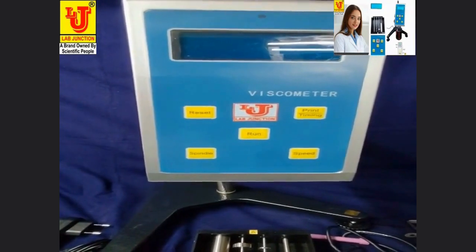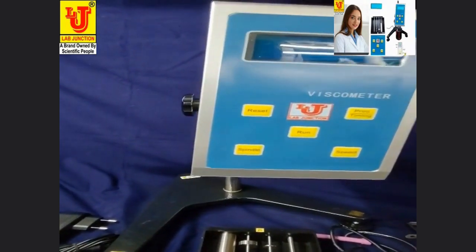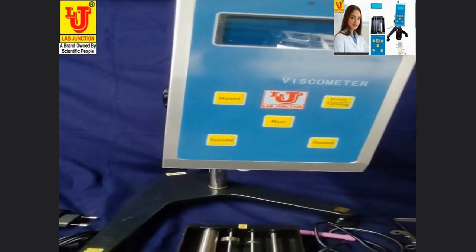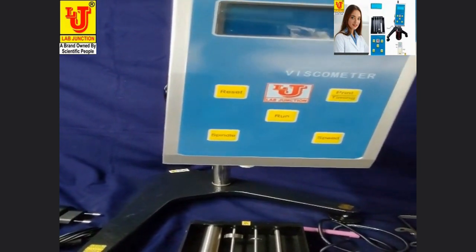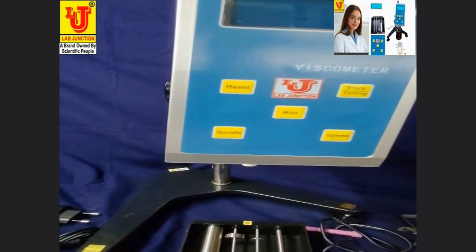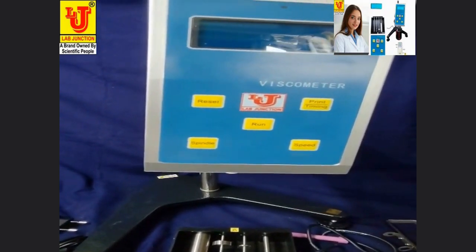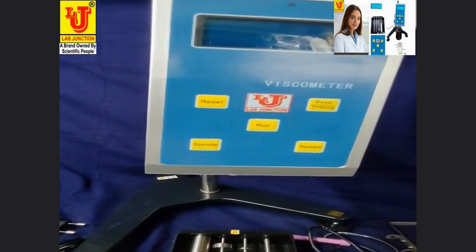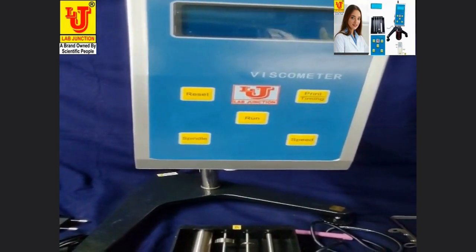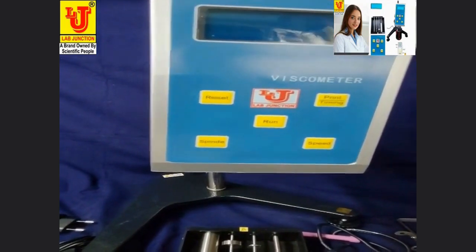The viscosity meter adopts a high-subsection driven step motor and 16-bit microcomputer controlled processor with LCD night visual display. The meter is stable and accurate in motion. The display is programmable and easy to operate, directly showing viscosity, rotating speed, rotor number, and maximum viscosity method. The main control board and subsection driven board are manufactured using surface mount technology (SMT), with a microprocessor of compact and advanced design.